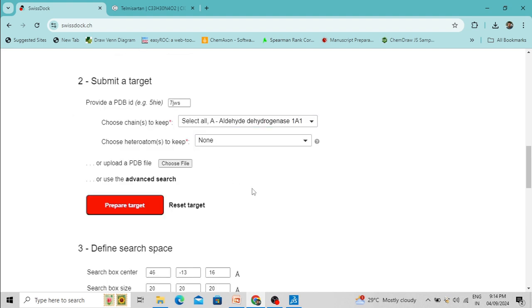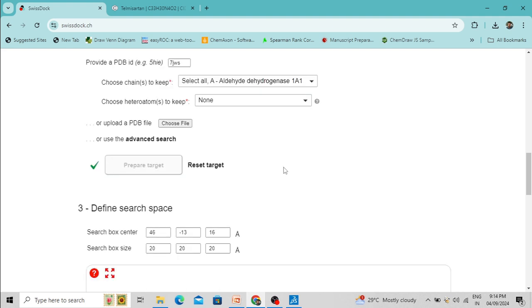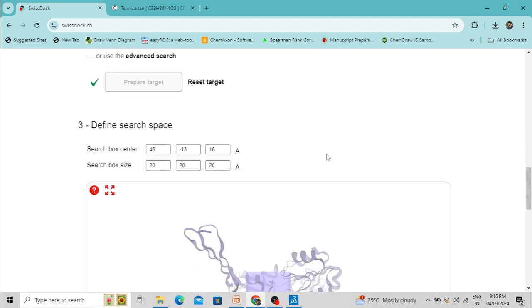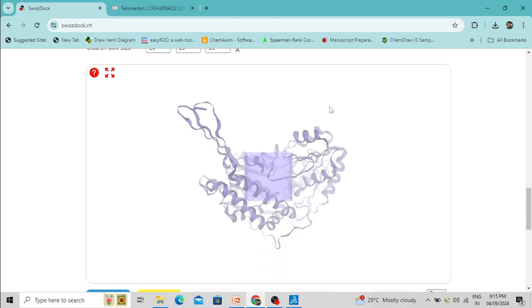Once you have chosen your protein molecule, click 'Prepare Target' and your protein molecule will be prepared automatically. A checkmark has appeared, indicating that protein processing is complete. Now there is an option for selecting the grid box.